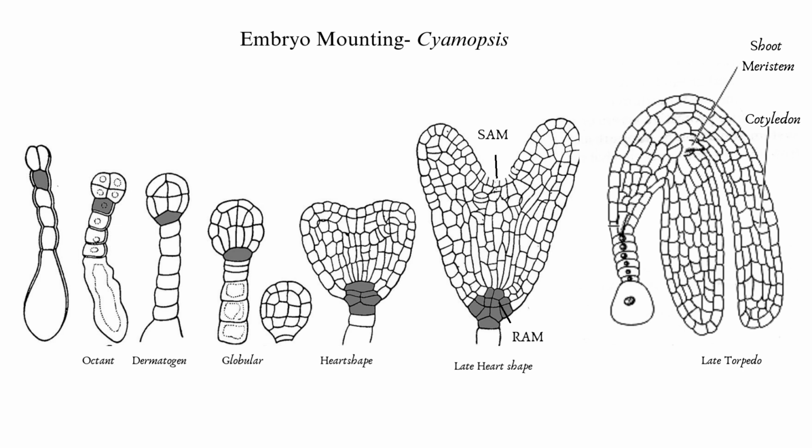Its embryo is a special one because the embryo of Cyamopsis tetragonoloba is green from the globular stage onwards. They may be physiologically active during development, although they reside deep inside the fruit wall and seed coat, and sometimes are surrounded by the endosperm. The chloroembryos do not photosynthesize in vivo, but are capable of in vitro photosynthesis at a rate which is similar to that of leaf tissue.